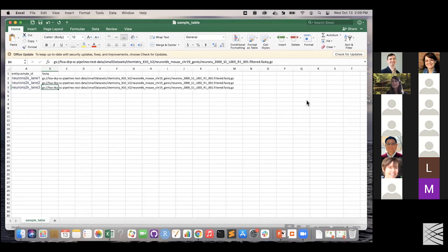Liz, I have a question, please. Yeah. So what should be the size? Is there any limit on the size of the file which has to be uploaded? I don't know what the upper limit is. It's pretty high.